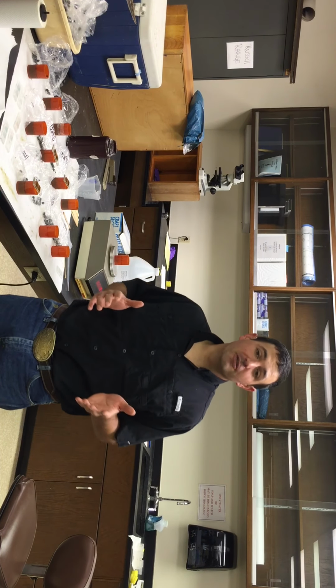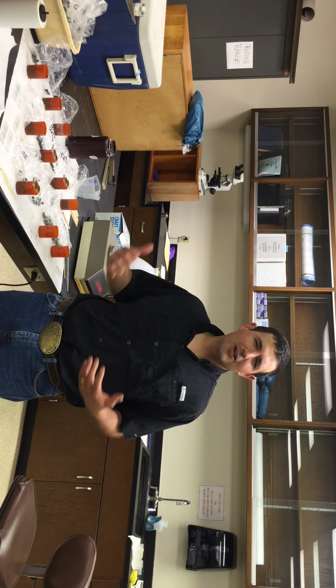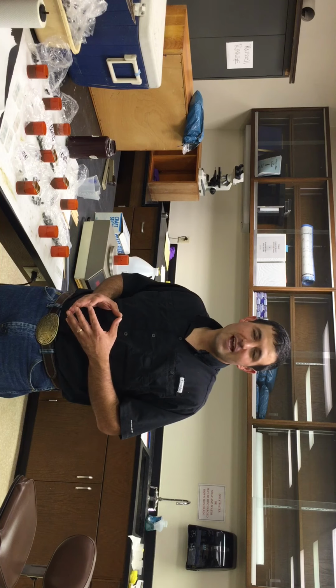Now, you've probably heard Reed and I mention that before, or talk about parasite resistance, or post something about parasite resistance, but how do we measure that information? How do we quantify that? Well, we actually do that with fecal egg counts, and that's what I'm going to walk you through this afternoon.